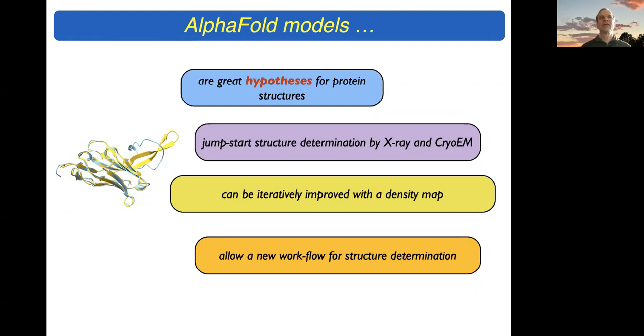In our Phenix software, you can use Dock in Map to do that. You can do that kind of thing in Chimera very readily. ISOLDE will do that. Other cryoEM programs can do that. Coot can do that. So there are many tools that can do all the things that I've described.